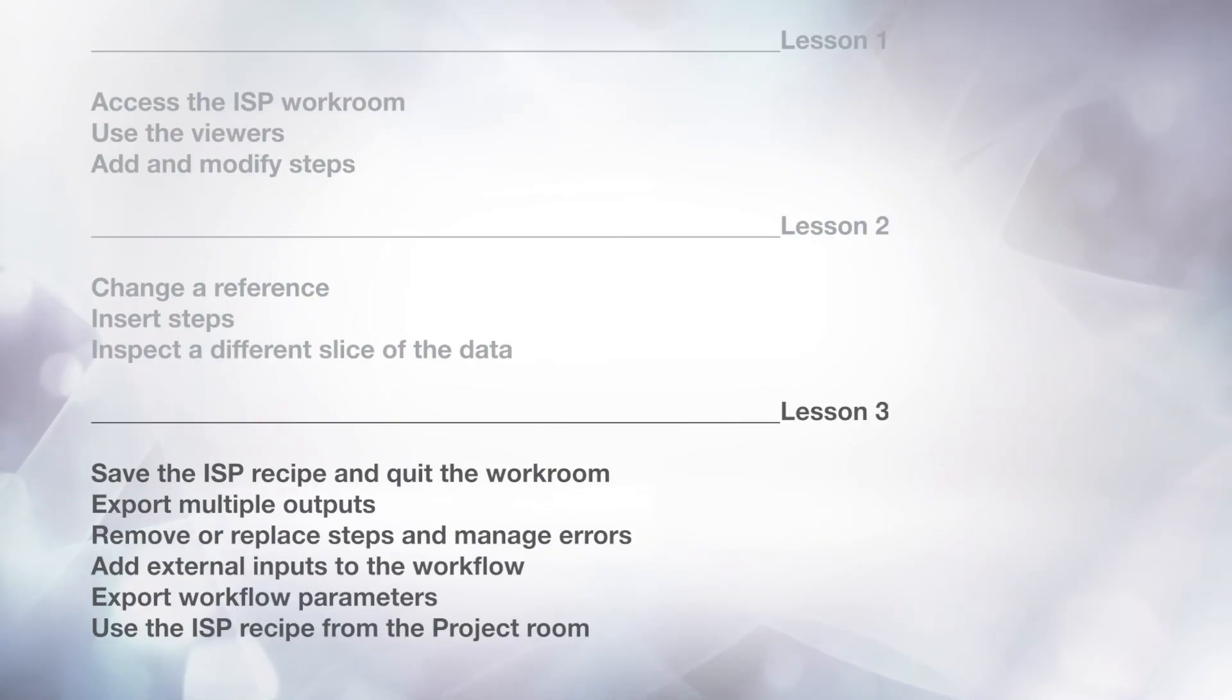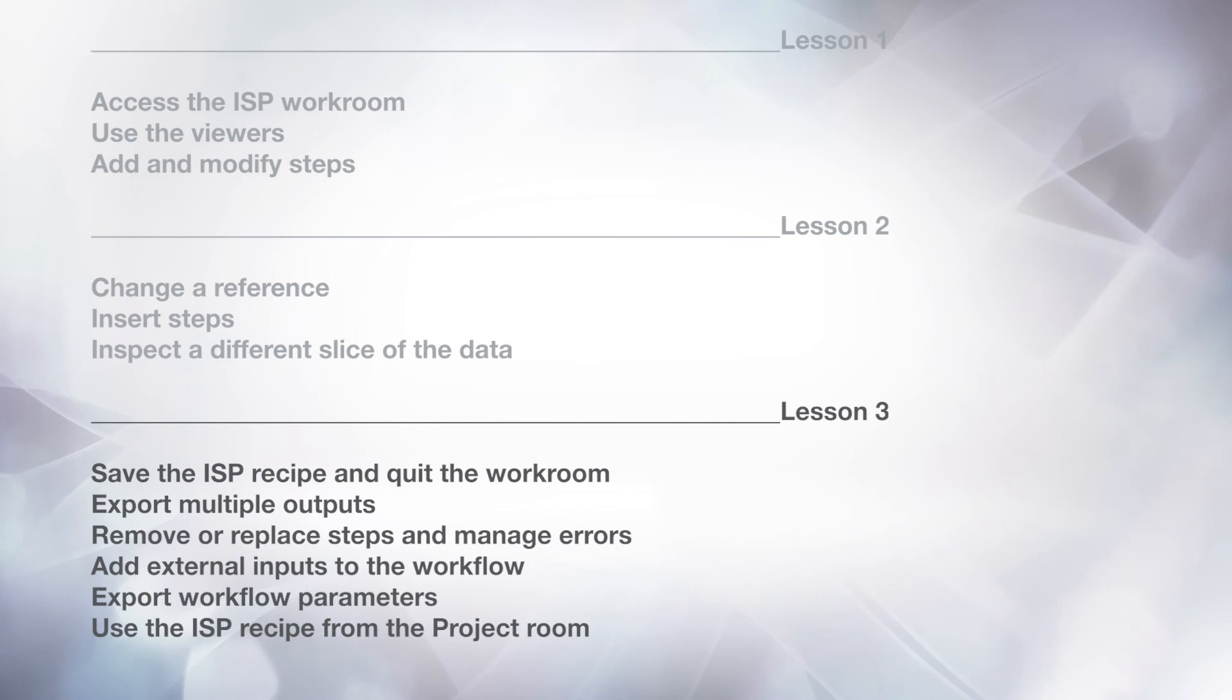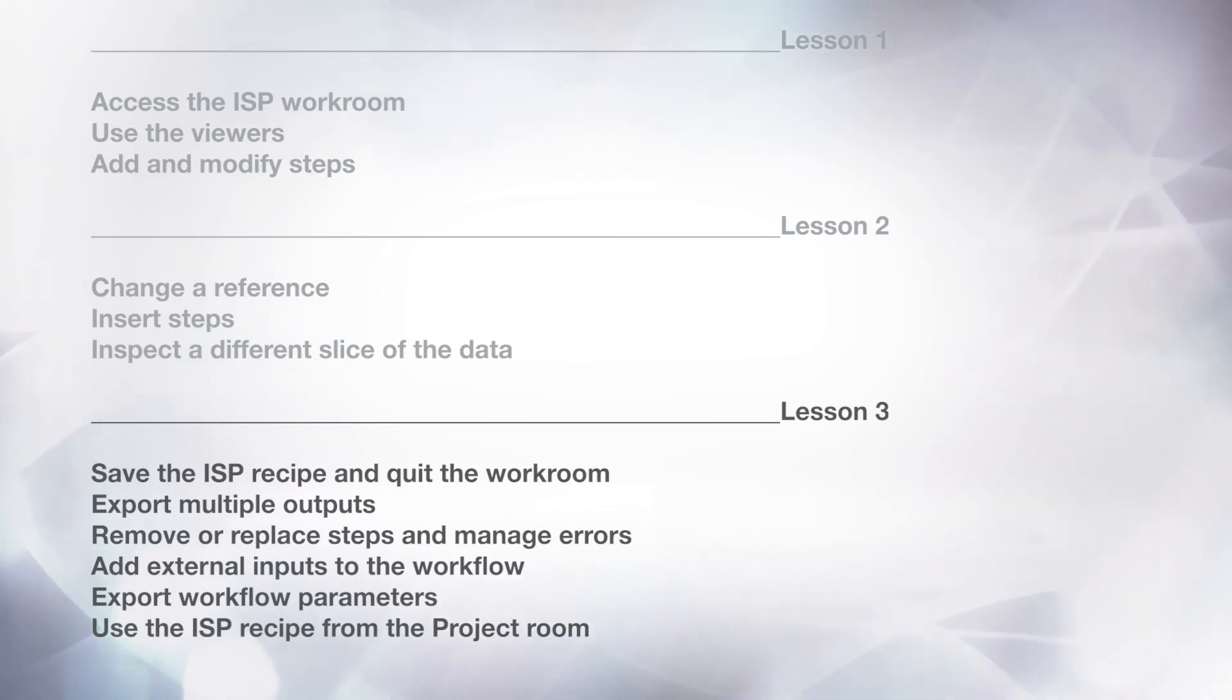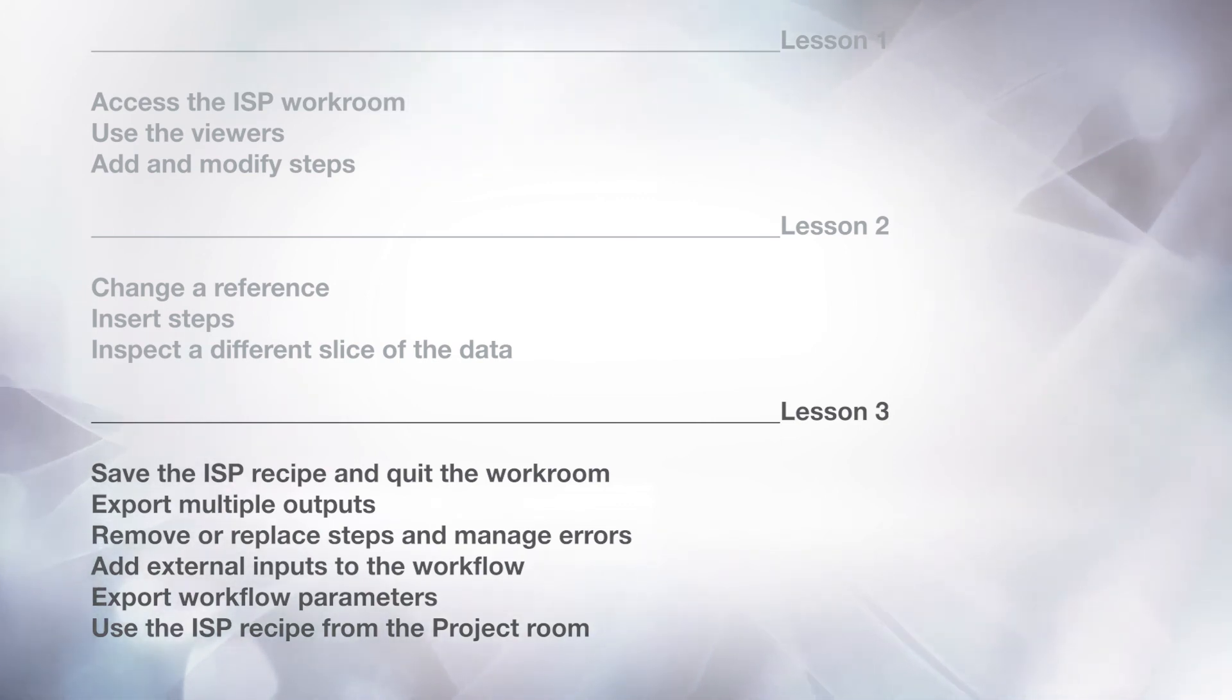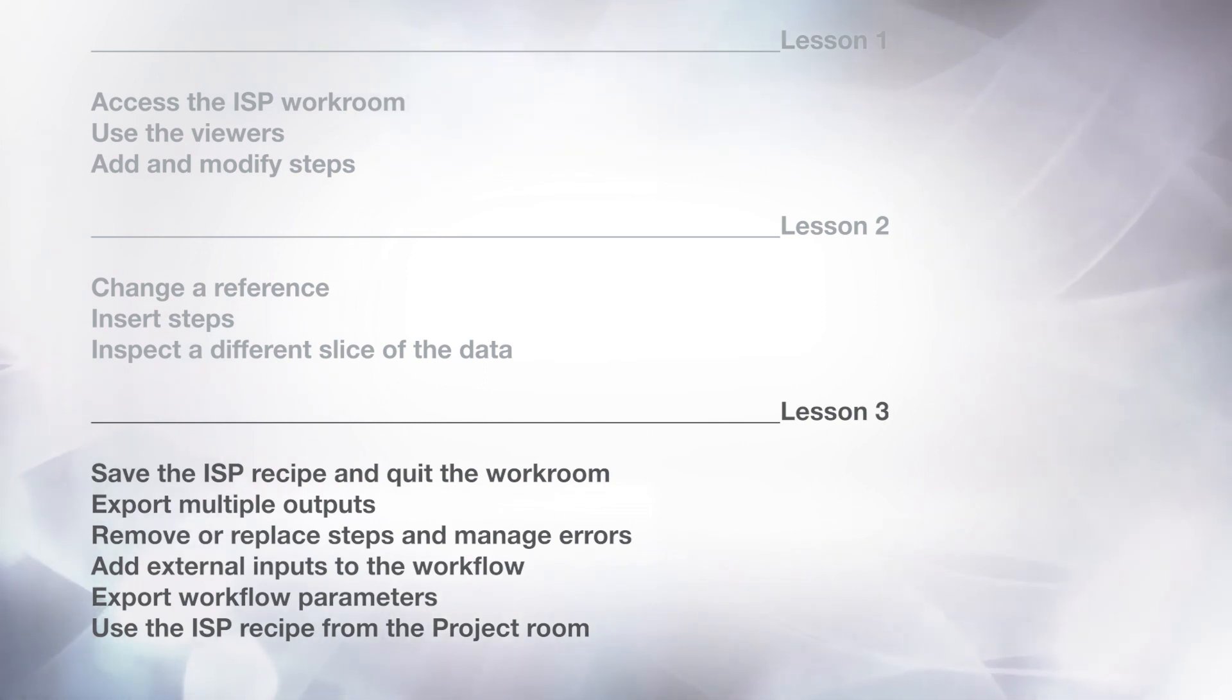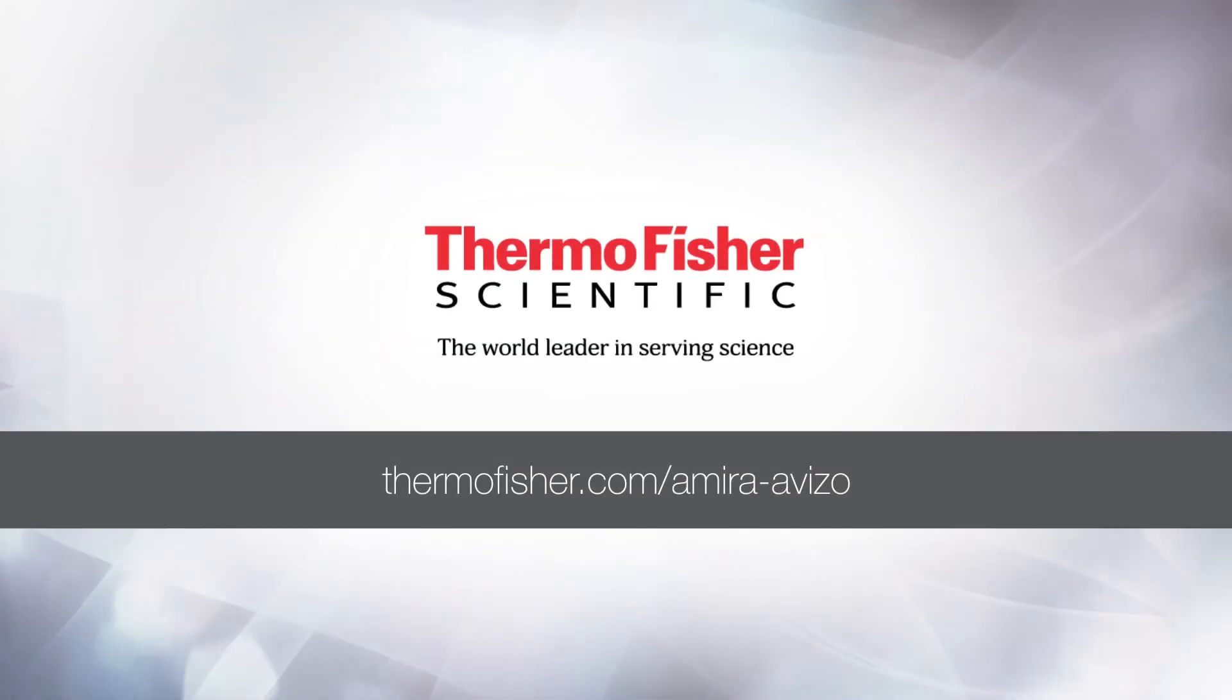As a summary, in this lesson and the previous ones, you should have learned how to access the image stack processing workroom, use the viewers, add and modify steps, change the reference, insert steps, inspect a different slice of the data, save the image stack processing recipe and quit the workroom, export module outputs, remove and replace steps and manage errors, add external inputs to the workflow, export workflow parameters, and use the image stack processing recipe from the project room. Goodbye and thank you for viewing these tutorials.